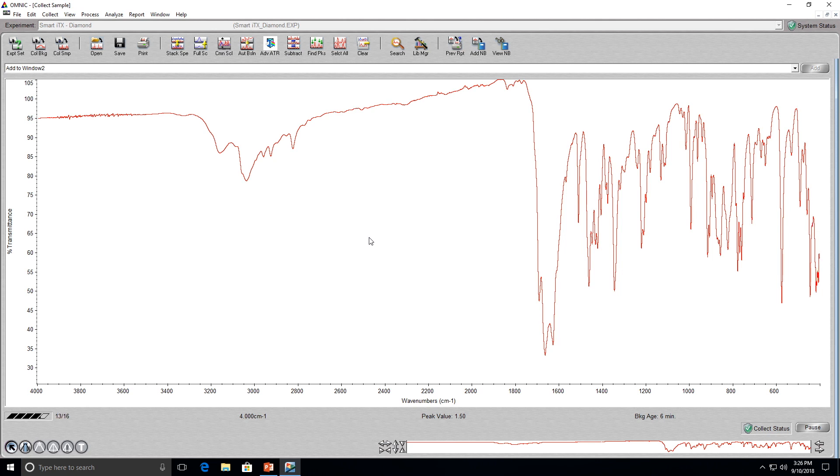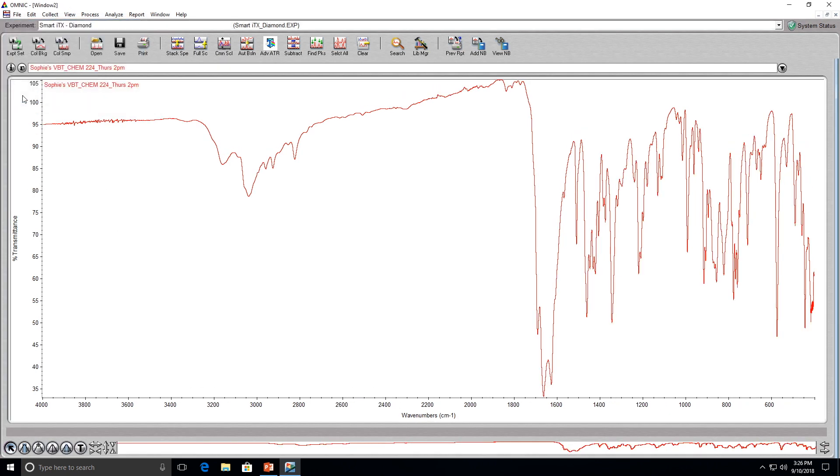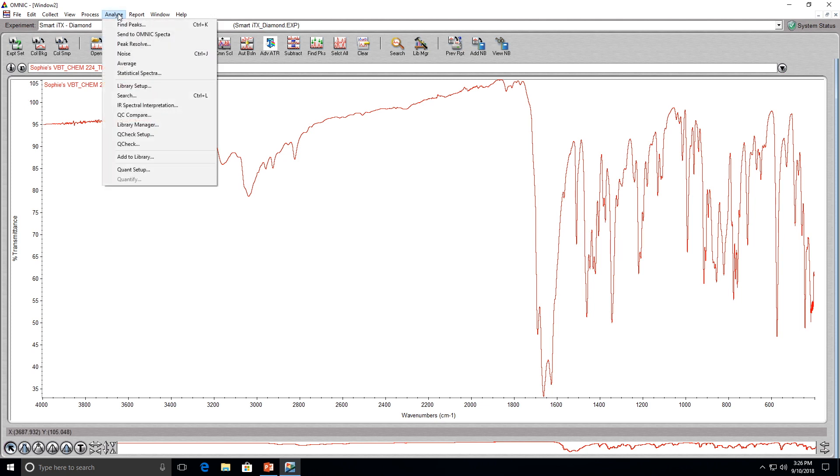Once the scans are complete, a box will pop up asking if you want to add the spectrum to a new window. Make sure to click yes. Now we can analyze our spectrum.